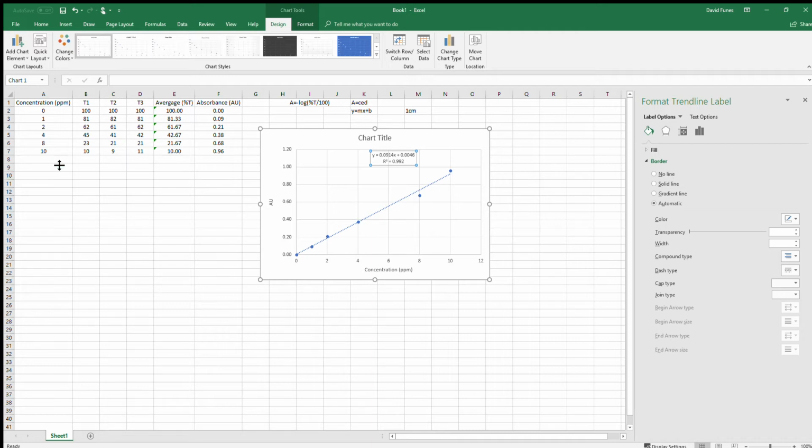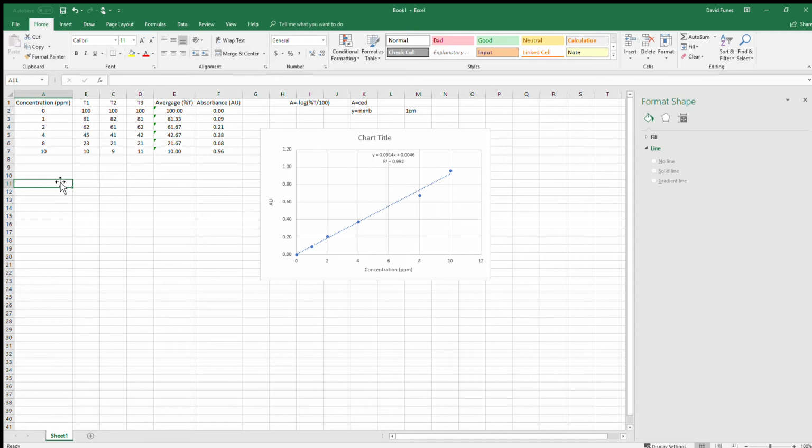All right, so you did have 2 unknowns. So I'm going to say unknown 1 here. Let me just actually continue. So I'm going to do unknown 1, unknown 2. Right, and hopefully you measured that 3 times as well. So I'm just going to make up some values here.